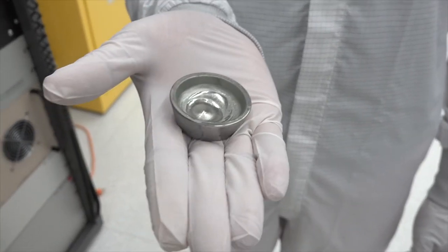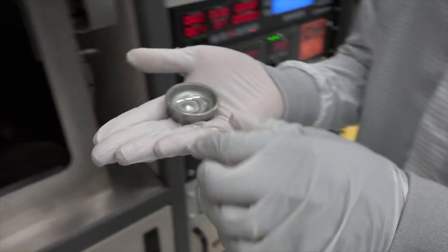The material we wish to evaporate is held in what is called the hearth. In this case, we want to evaporate gold. The gold is contained in a small metal crucible. This crucible is then placed in the hearth. This particular instrument can accommodate up to four different materials in the hearth.